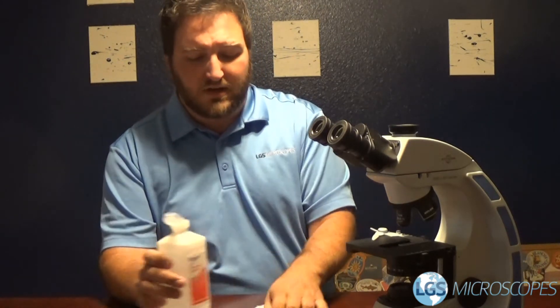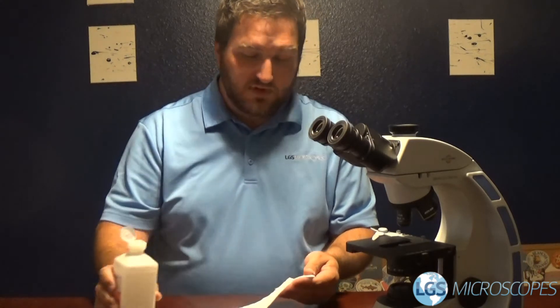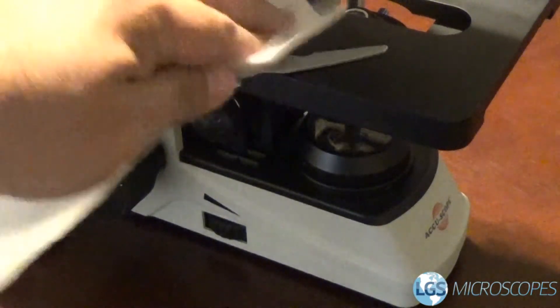The best way to think about it is to think about the parts that you touch first. So everybody has their own little way of doing things, but obviously you're going to load the slide in first, so go ahead and wipe the slide holder there.